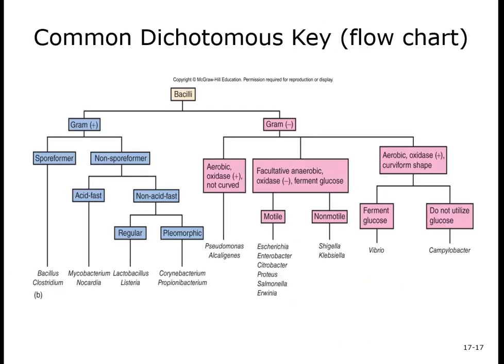Usually when we do phenotypic testing, we don't just do one test, we do all of the ones I just told you about. And there are these things called flowcharts, and you don't need to memorize these because most labs will have giant books of these flowcharts that you can go to and look at. So basically, for these flowcharts, you always will start with a gram stain, and you'll first look at the shape. So for example, you see a bacillus-shaped bacteria. Now, if this bacteria is purple, you know it's gram-positive. If it's pink, you know it's gram-negative.